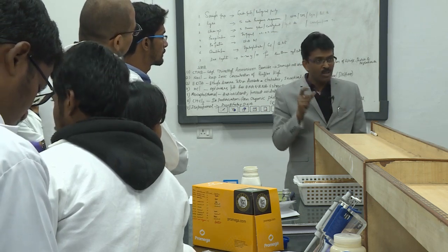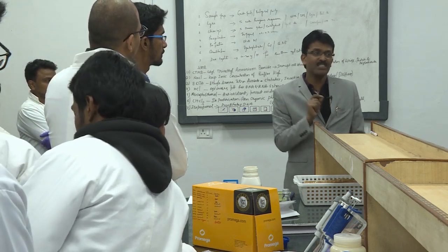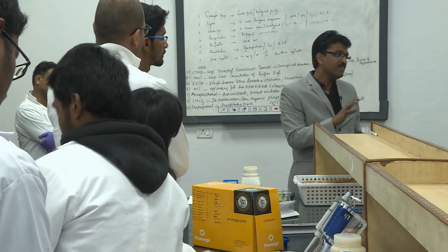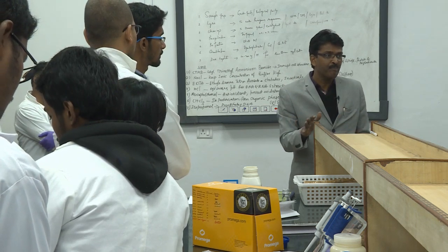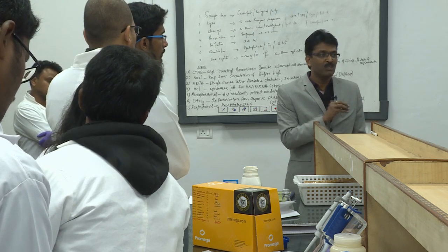Remember, the stock DNA is in TE 10:1 only, right? From there you make a working DNA in water and you spend it. That kind of DNA, you do not make too much quantity, you make around 10 microliters or 20 microliters and do your experiments, and do not try to store it for future backup. So, use it, throw it.